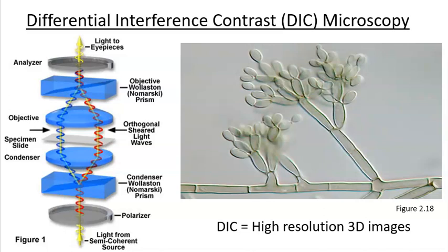And so what you're doing here is kind of how they make three-dimensional movies. In the old days, they would actually take two cameras and shoot them from different angles and then overlay the film on those things to give you that three-dimensional feel to it. Same idea is going on here with this kind of microscope.